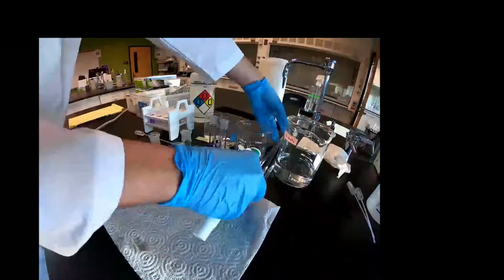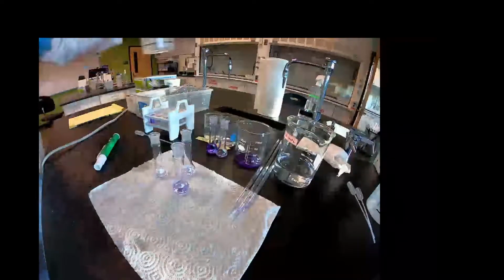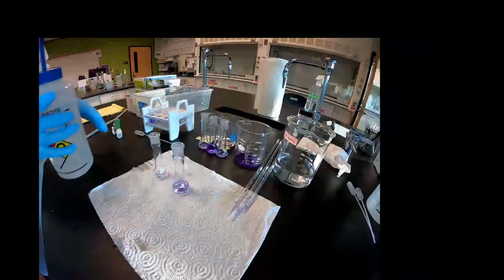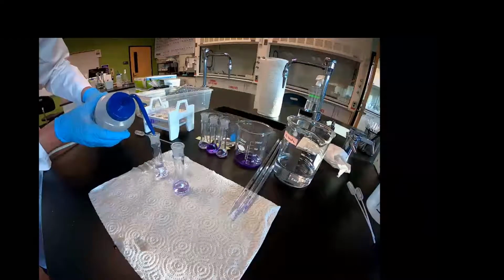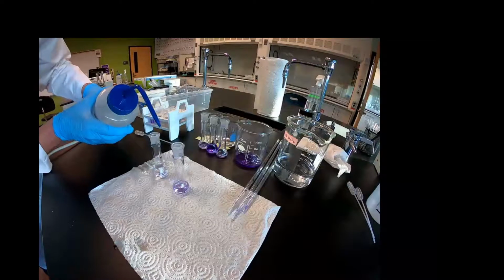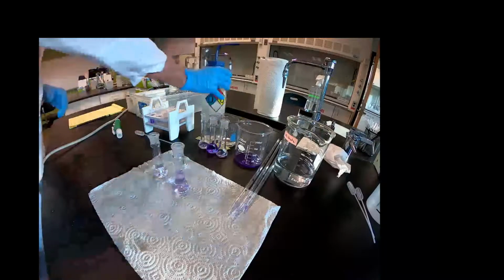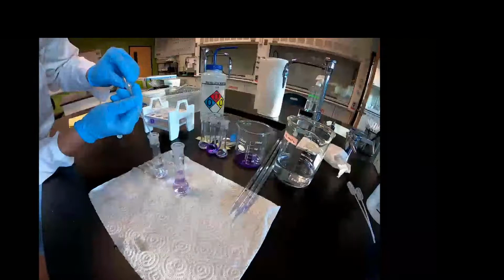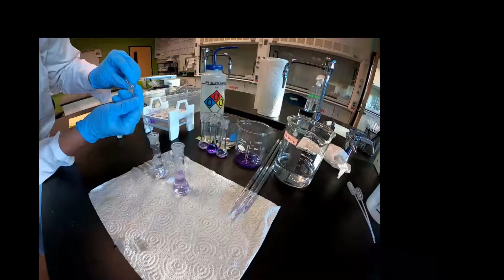Now we need to dilute it to the mark with water. Again, you dilute it to the 10 mil mark. These volumetric flasks are marked 10.00 or 10 mils with a plus or minus of 0.04. So that should guide you on what to write into the volume. You do the calculation, and the last drops are just water added out of the little disposable pipette.